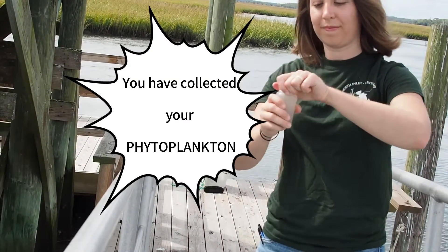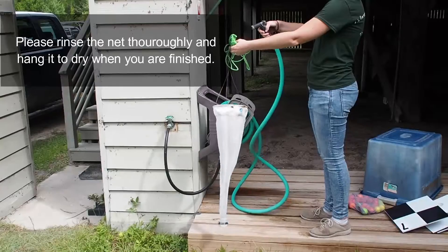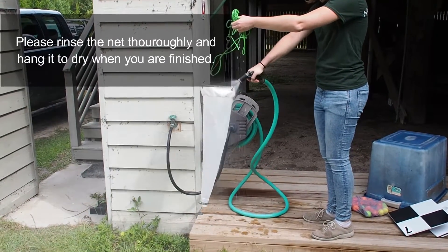You have collected your phytoplankton. Please rinse the net thoroughly and hang it to dry when you are finished.